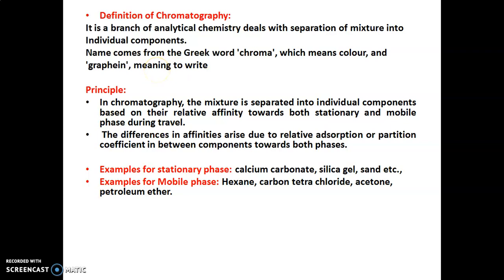Next, what is the principle of chromatography? ಪ್ರಿನ್ಸಿಪಲ್ ಅಂದರೆ, in chromatography the mixture is separated into individual components based on their relative affinity towards both stationary and mobile phase during travel. The difference in the affinity arises due to the relative adsorption or partition coefficient in between the components towards both stationary and mobile phase.